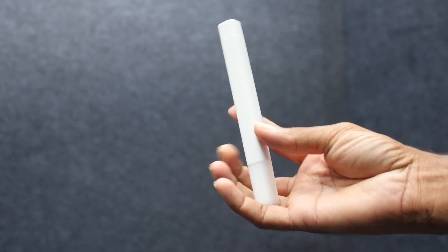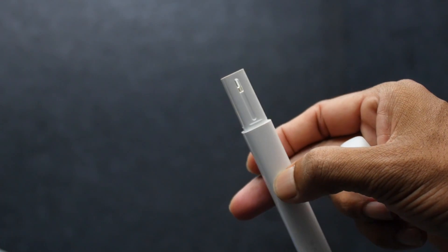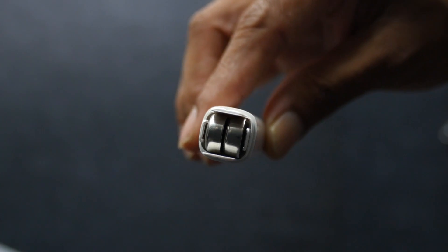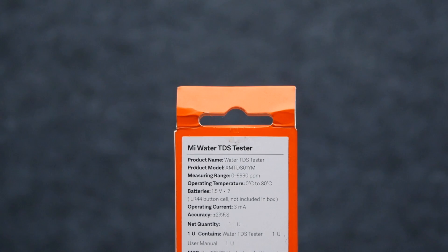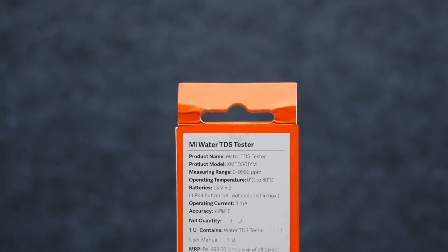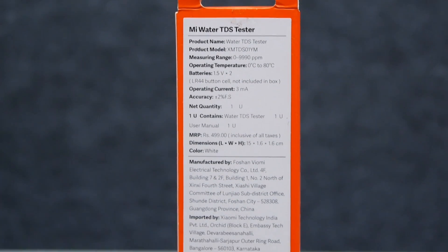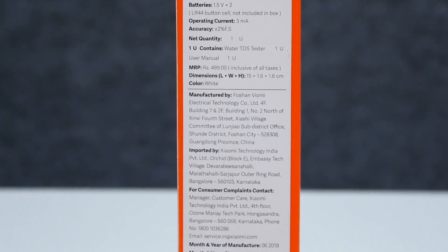You can use the TDS and temperature functions. There is a cap on the probe end, there is MI branding with the Mi logo on the device. In the box, there is a user manual and battery information.